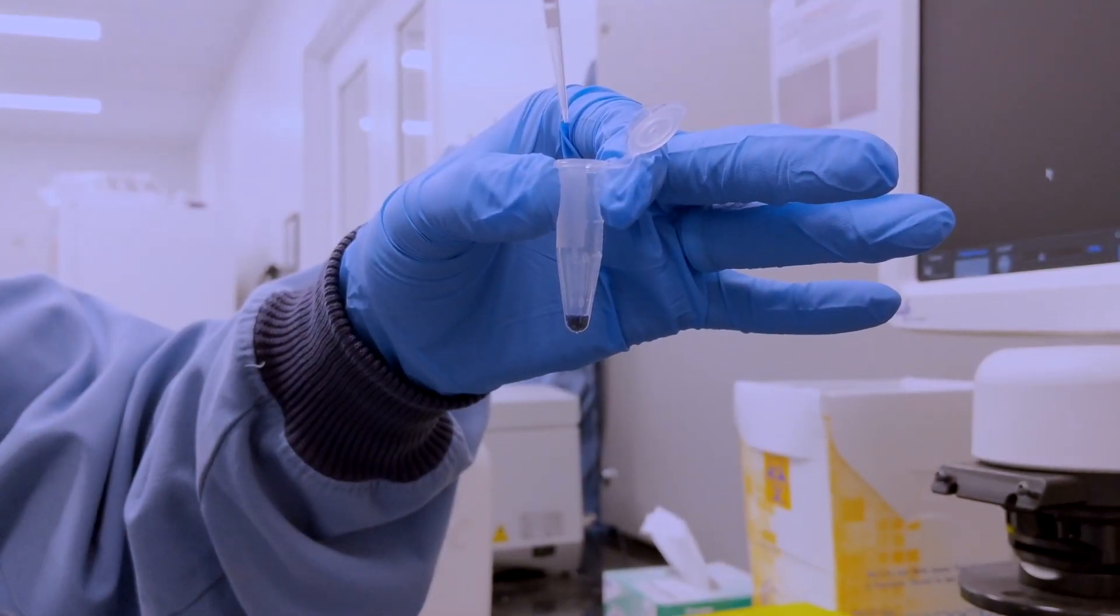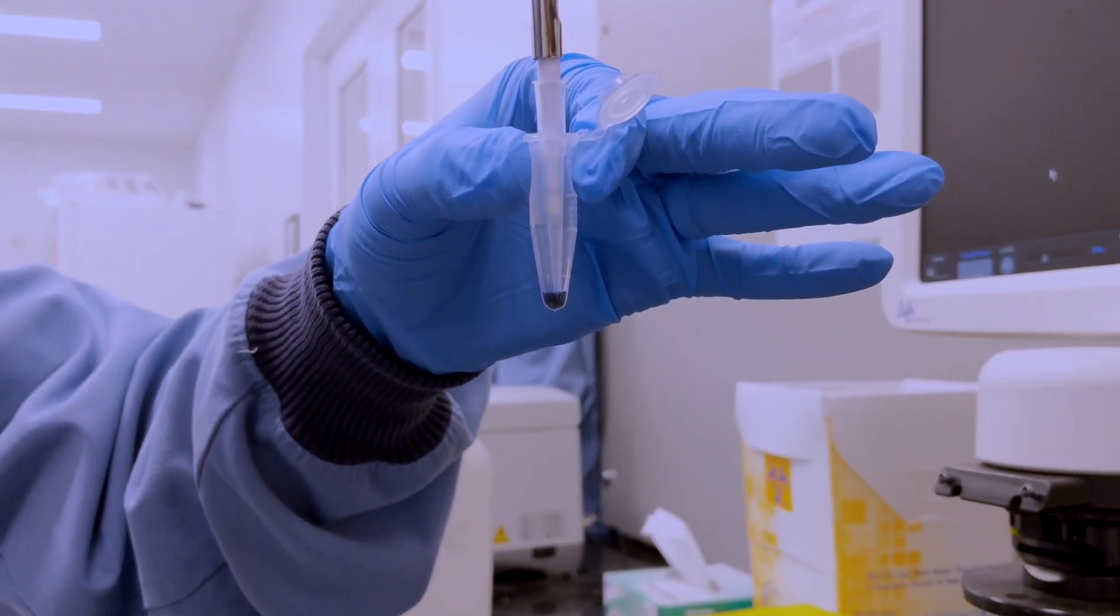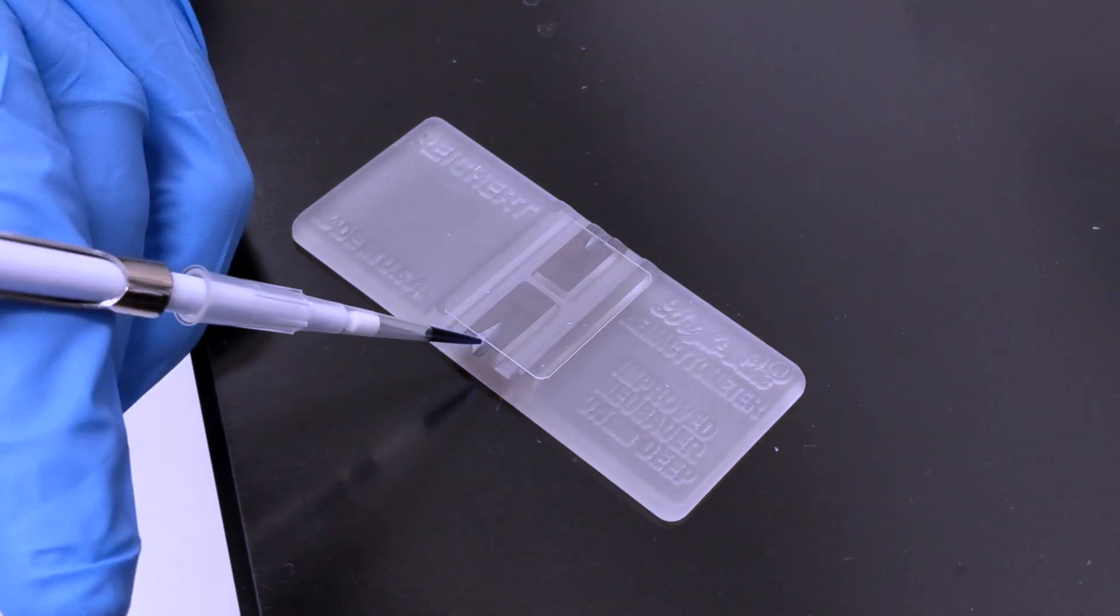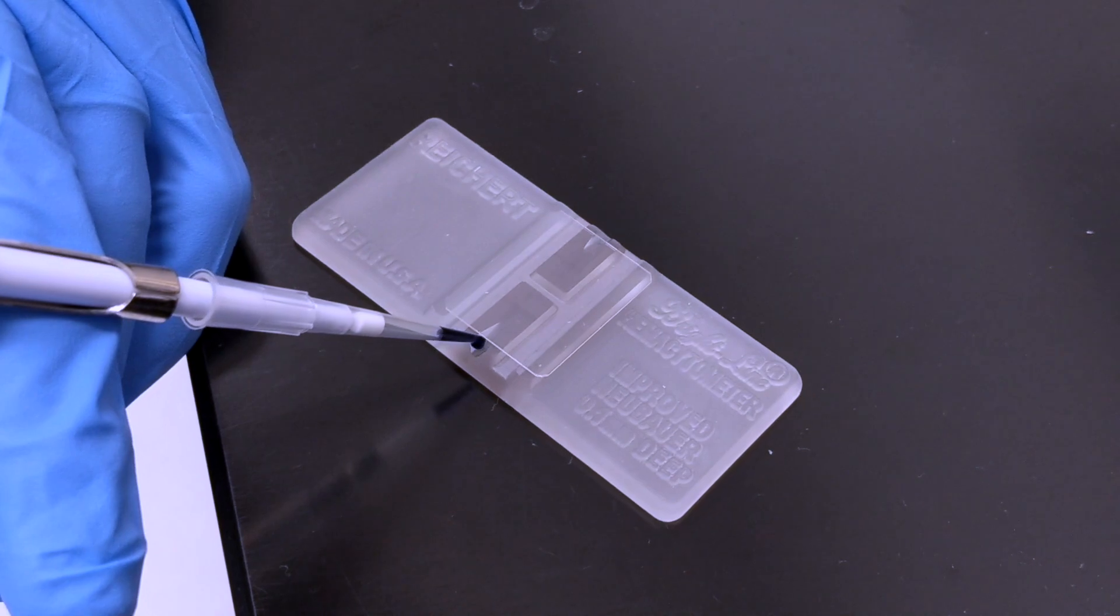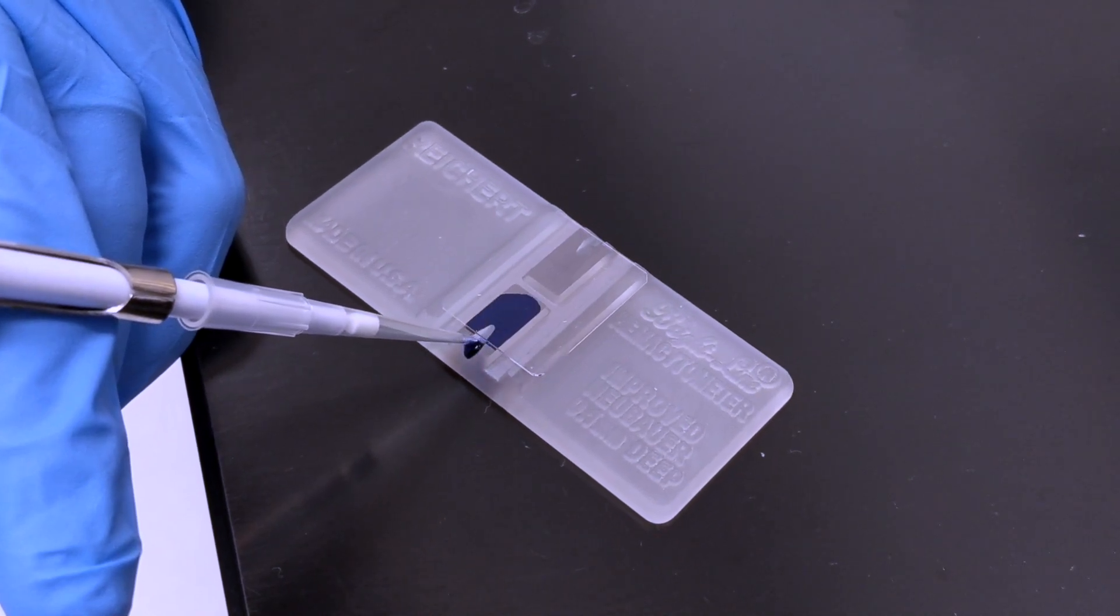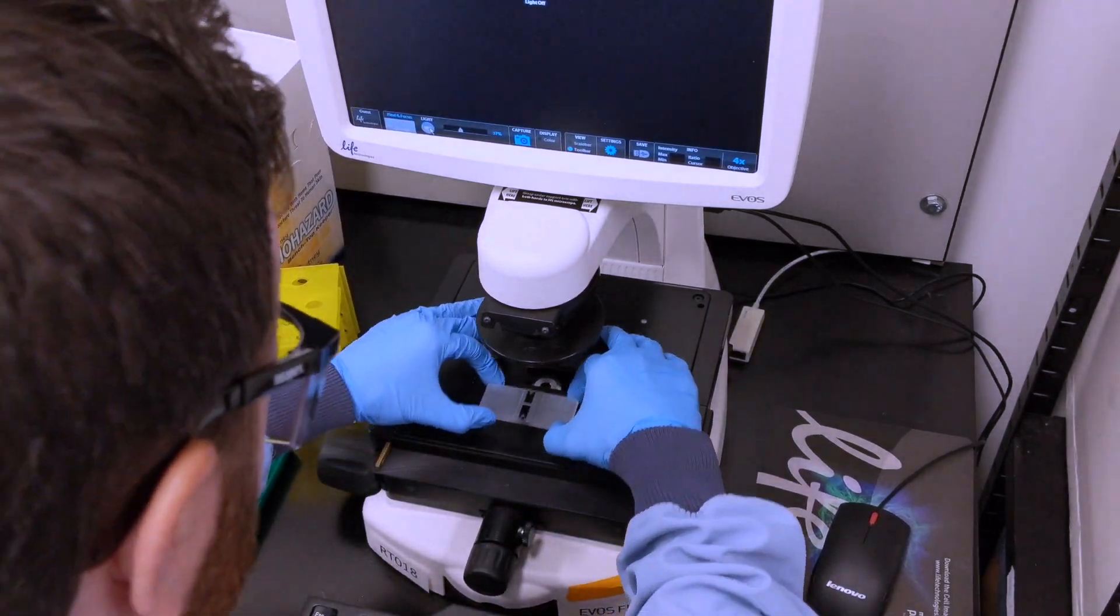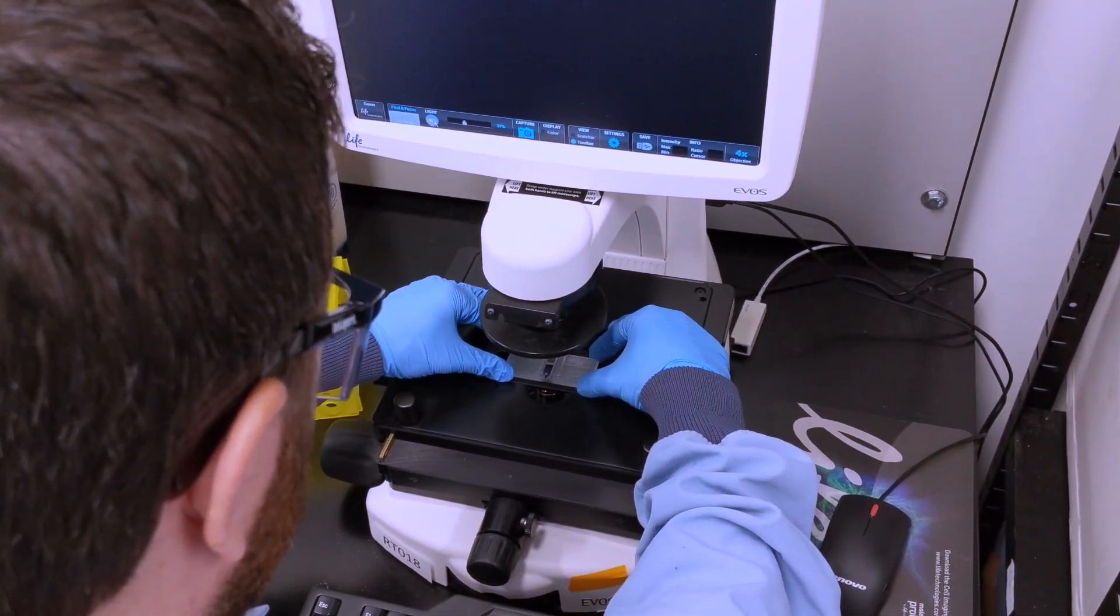Once mixed, withdraw 10 microliters of the Trypan Blue cellular suspension using the micropipette. Gently expel the 10 microliters suspension into the hemocytometer. Place the hemocytometer onto the microscope and allow the cells to settle for two or three minutes.